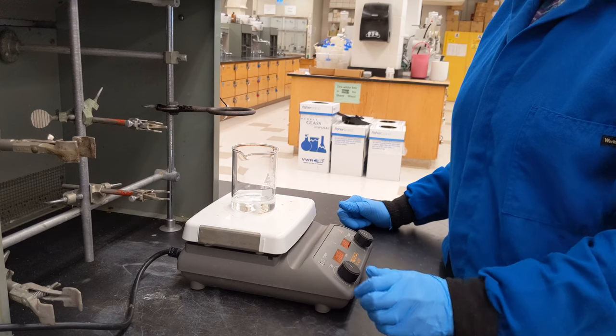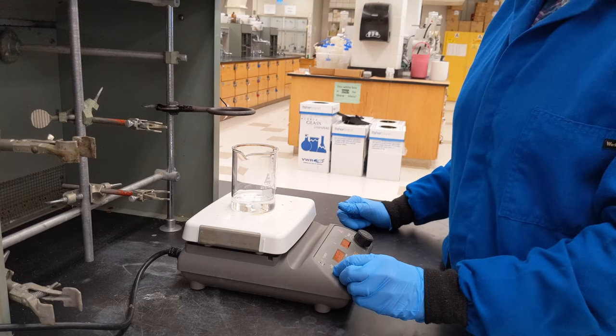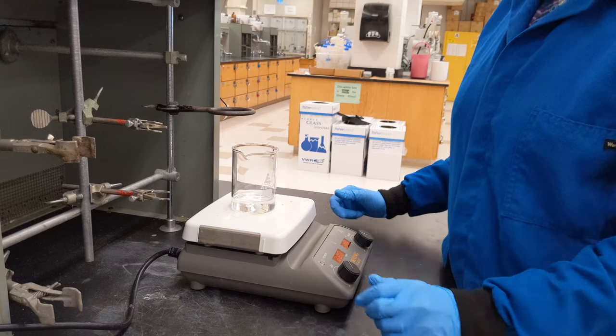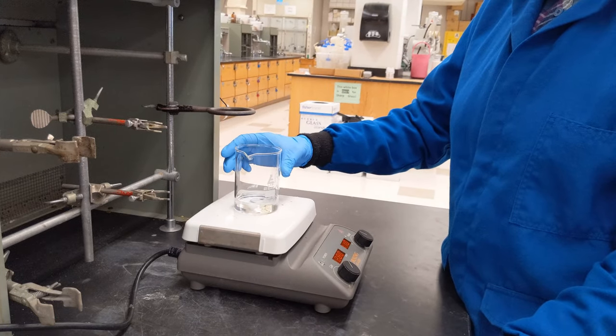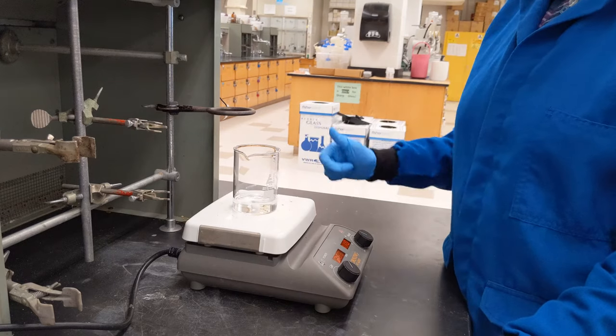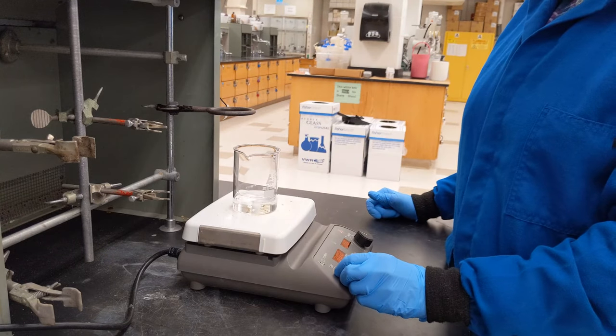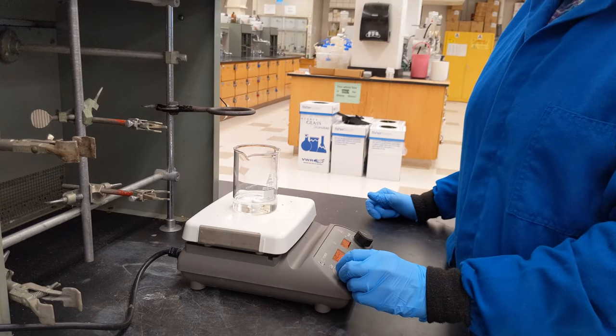There's a magnet inside of the hot plate that actually spins when I turn on the spin function. In order for this to work effectively, I need to make sure that my piece of glassware is centered because the stir function is going to occur right in the center.